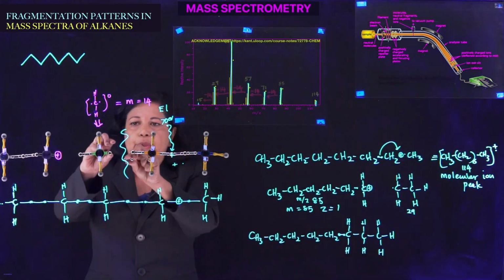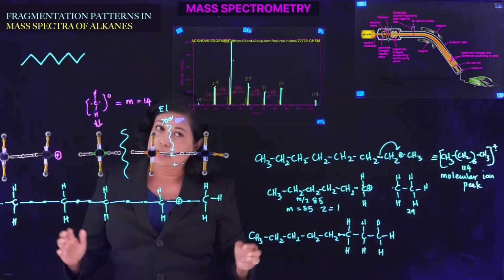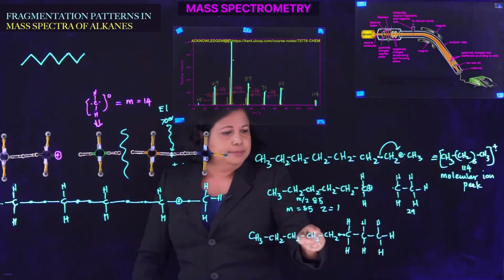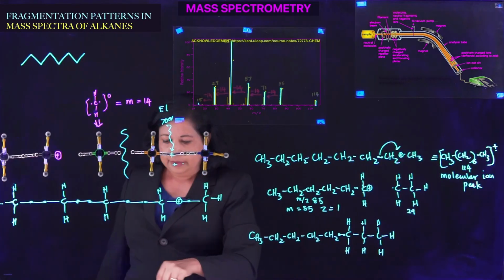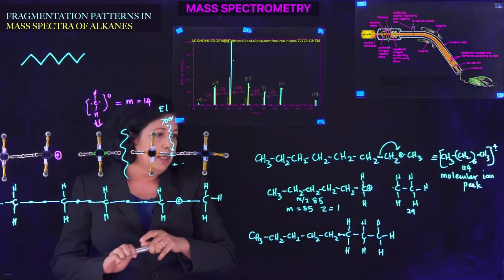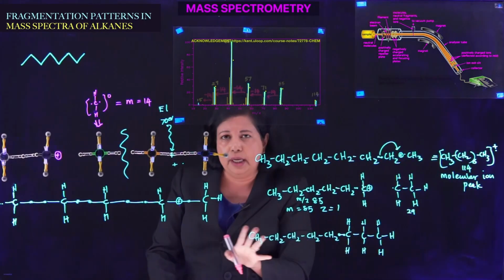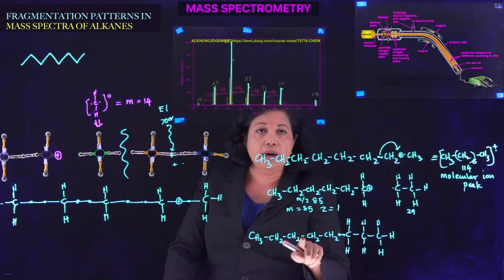Let's say you have over here, these are my son's toys, once upon a time. If you take this and rip this off, you can have a lightning hit right here instead of at the edge. It could happen anywhere in the molecule. Here you could have it here or here.